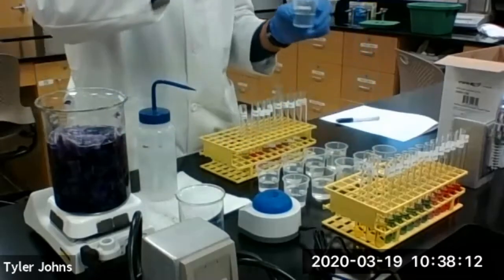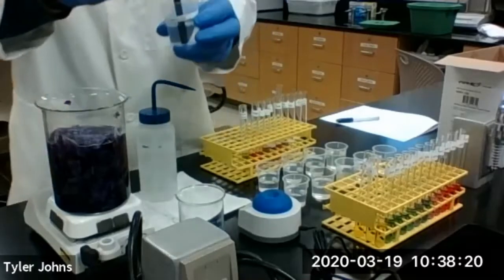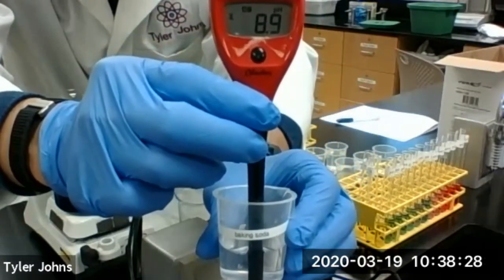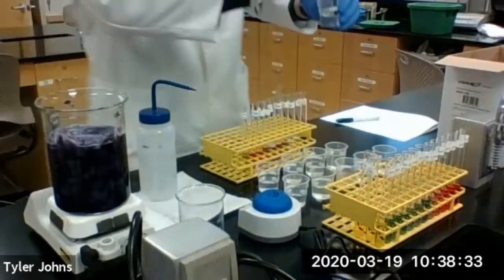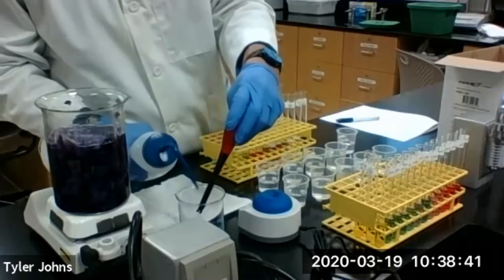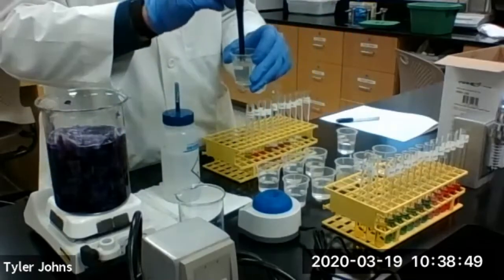Let's start with our baking soda solution. There's our baking soda solution. And our pH reading from the pH meter. Okay, let's rinse. Now we'll move on to our drain cleaner solution.